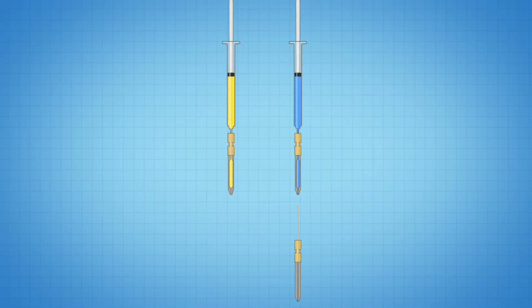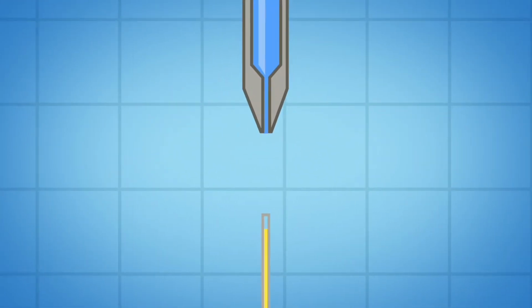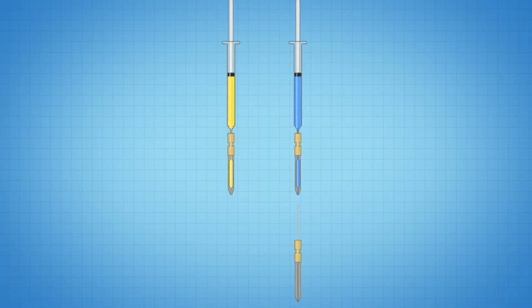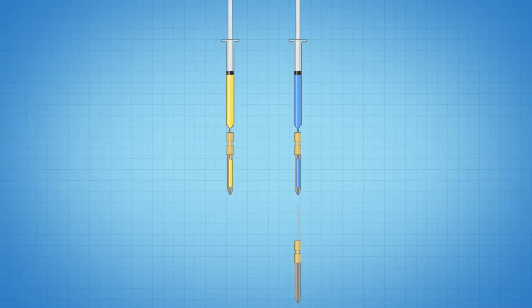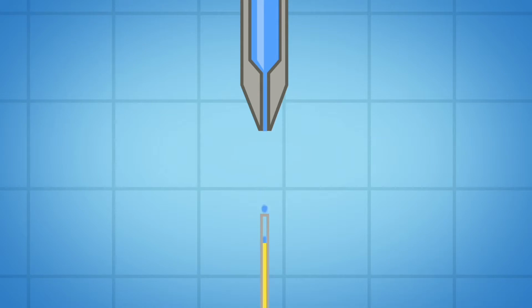The collector is a partially oil-filled capillary tube oriented vertically with the unfilled portion of the tube facing upward like a cup to be filled. The volume that is unfilled is the concentrated volume. The ejector is oriented above the collector with the ejector facing downward such that the droplets will eject precisely into the center of the unfilled portion of the collector tube. As the droplets eject, the tube fills to the top with the nearly evaporated droplets.